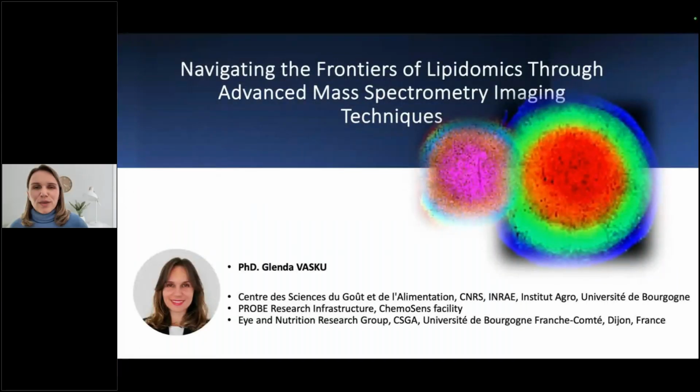Great. Thank you very much for the invitation. I am very pleased and honored to present today one part of my PhD studies. As you said, I recently graduated in 2023, and my main research area is lipidomics, especially untargeted lipidomics, mostly applied to imaging mass spectrometry, which I will be discussing with you, with a little bit of applications based on the data that I obtained during my PhD.